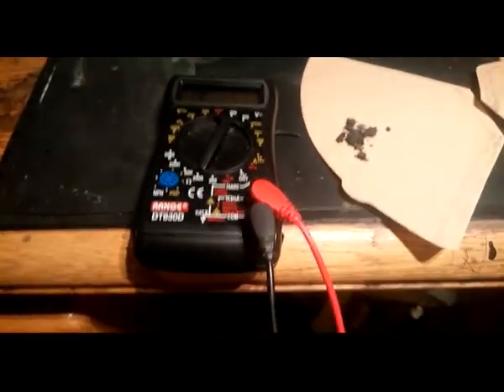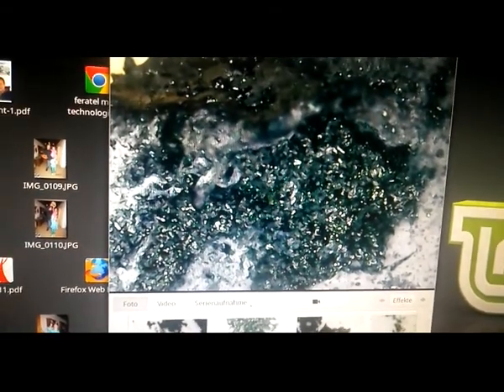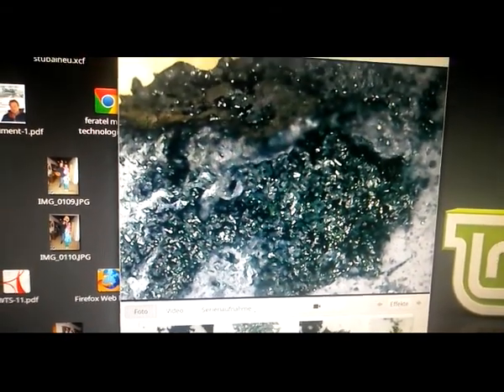Let's have a look under the microscope. Here you can see the graphite foam under the microscope. Bye.